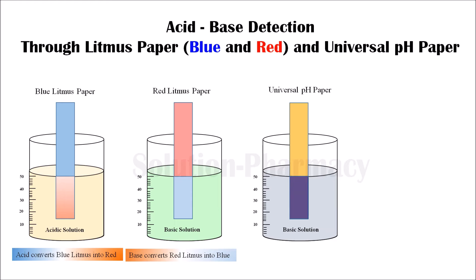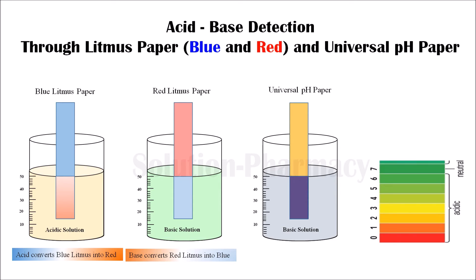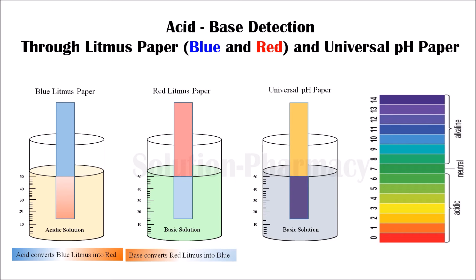By this color change we can get the approximate pH value of the solution. We have to match this color change with the pH color scale. Here you can see on the right side the universal pH scale, with different values represented by different colors. The color changes to dark blue, which matches the color at value 12 on the pH scale — which is alkaline — meaning the pH of our solution is approximately 12.